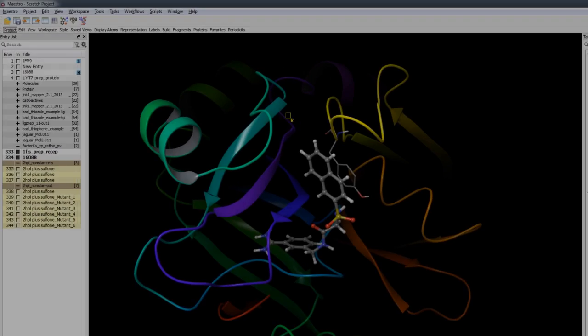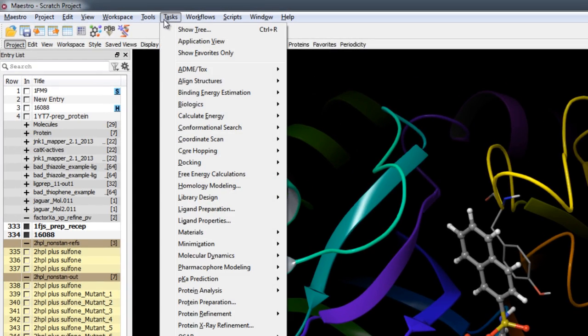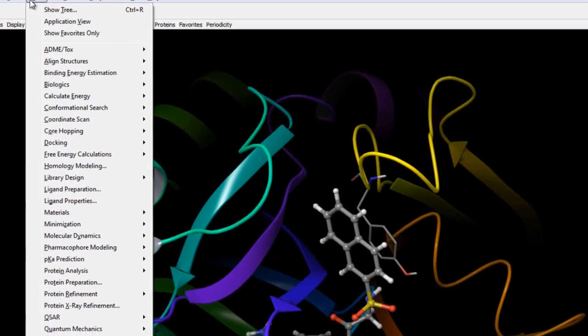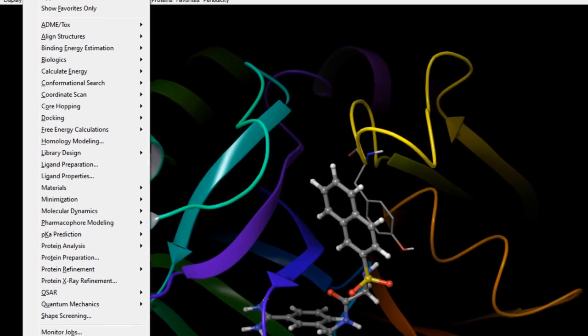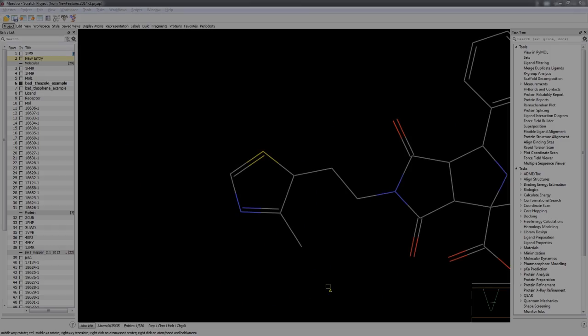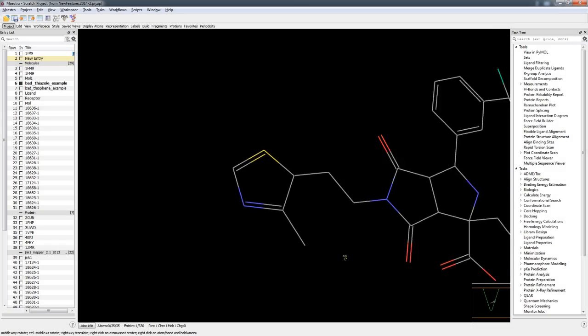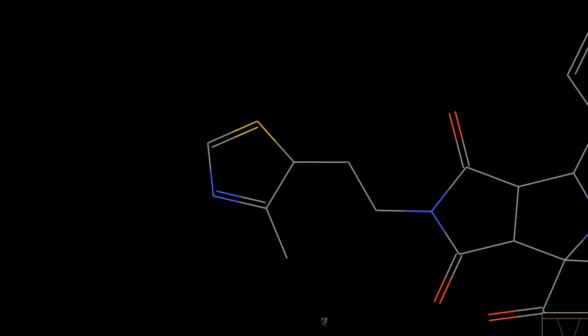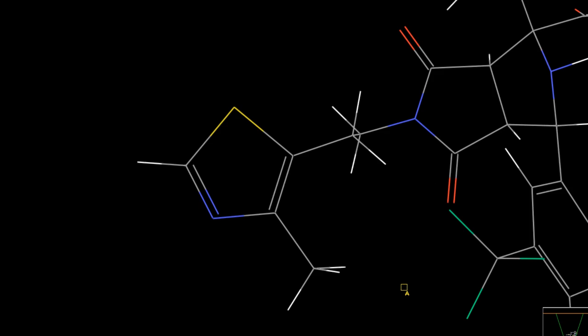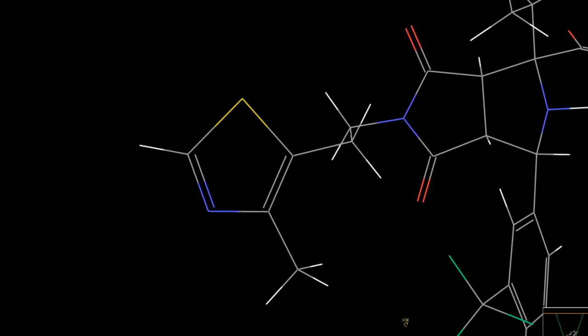Among the individual applications and tasks, various scientific, usability, and performance improvements have been made. For example, during ligand preparation, misdrawn sulfur-containing molecules such as thiazole or thiophene are automatically identified and corrected.